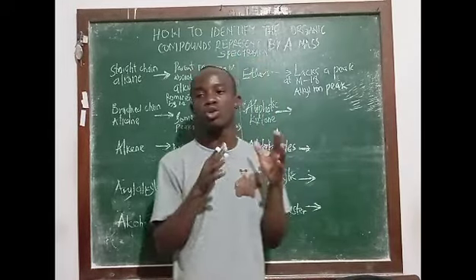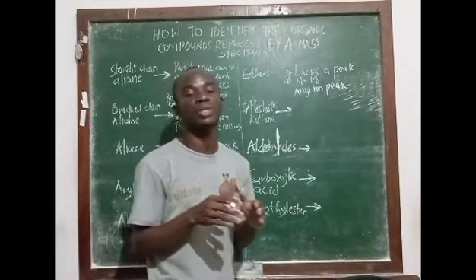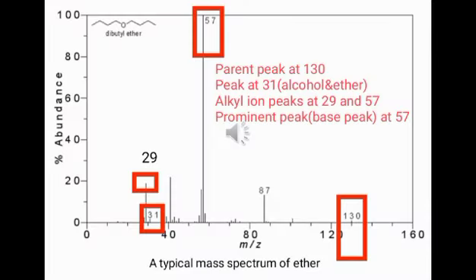And that's how to identify the mass spectrum of an ether, and at the same time to differentiate it from the mass spectrum of an alcohol.